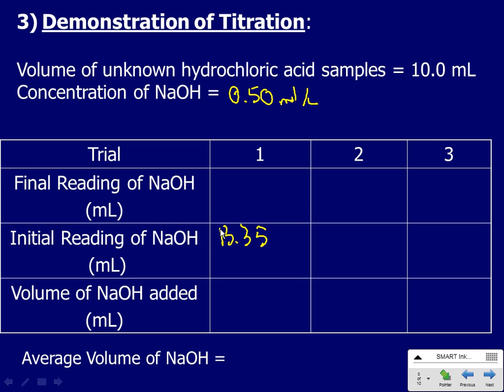So now I'm going to get a drop out. Whoops, there's 2 drops. Oh, no. Oh, what a catastrophic 2 drops. That's way too dark. 2 drops. I got 1 drop too extra from my patience. As you can tell, I'm a very patient person. Too dark. I would probably want to redo that one. Actually, it's okay. There is worse. Like this is darker than that one, right? So that's a better titration. But if I had been patient with that last drop, I would have been okay.